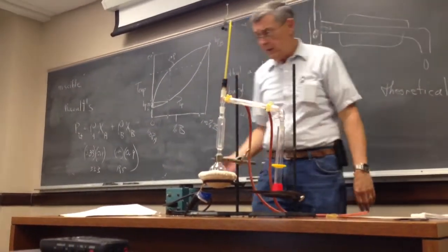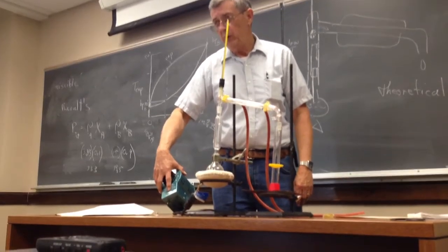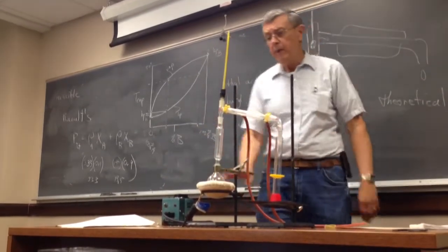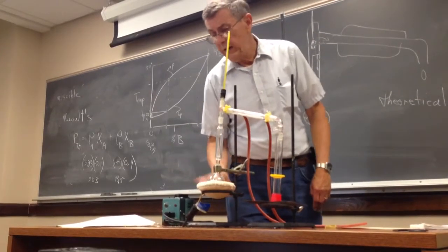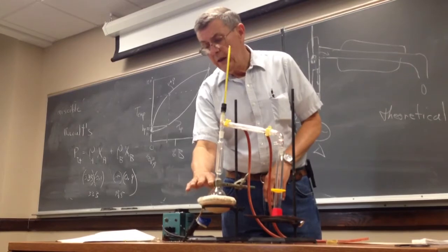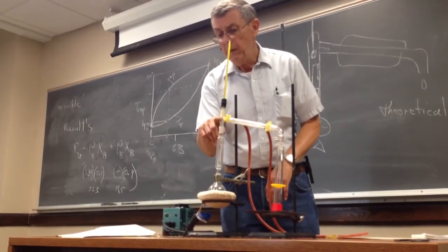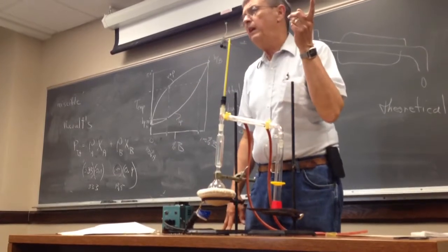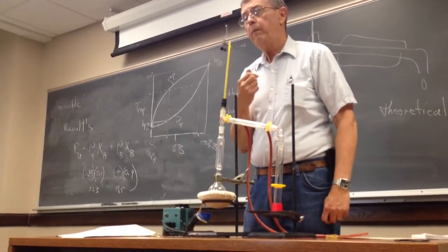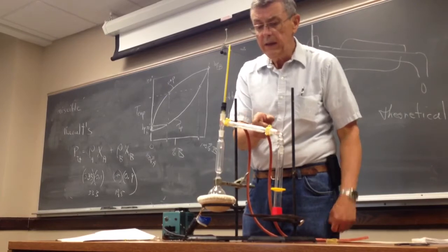Okay. So to start up the distillation, what you would do is turn this on and then turn this rheostat, it's called a variac, up to about 70%. And it'll start to heat up. And you'll know it's heating up because this will start to get warm. You will look at the liquid. You'll see convection currents in it. Eventually you'll start to see bubbles. Then you'll see those vapors coming up and condensing, and you'll get a liquid vapor ring, and you'll see that climb up and climb up. During all that process, this thermometer won't do much of anything. As soon as that liquid vapor ring gets to the bulb, then your temperature will go up. Then that liquid vapor interface will come over here, and you'll start to condense and start to run down.